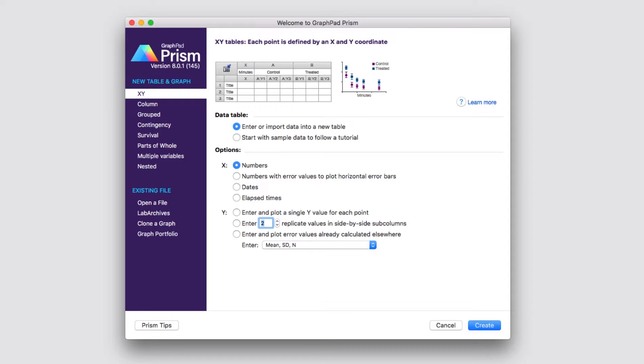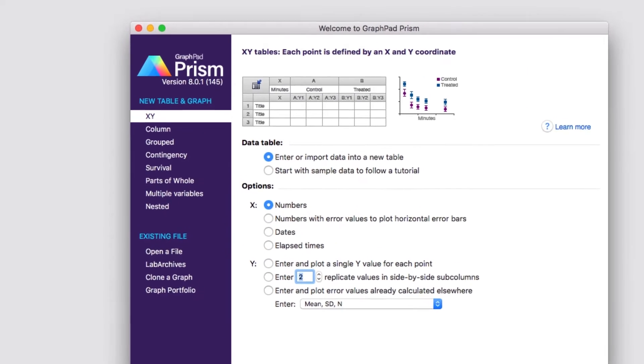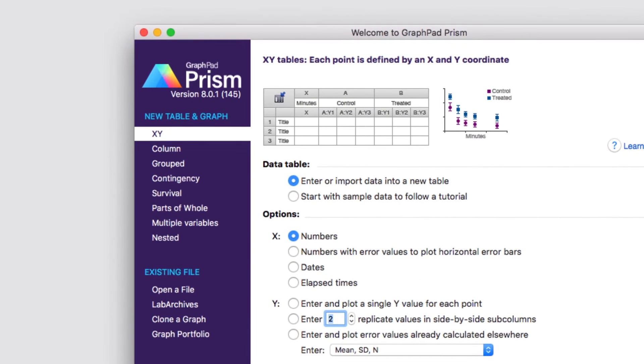When you first start Prism, the first thing you're going to see is the welcome dialog. From the welcome dialog, you can choose to create either a new data table and graph, or to open an existing file and work with that. If you're going to create a new data table and graph, it's important to understand the eight different types of data tables that Prism uses. Two easy ways that you can do that is to check out our video on the eight types of data tables, or you can use a tutorial data set.